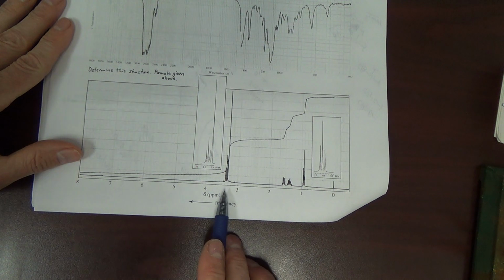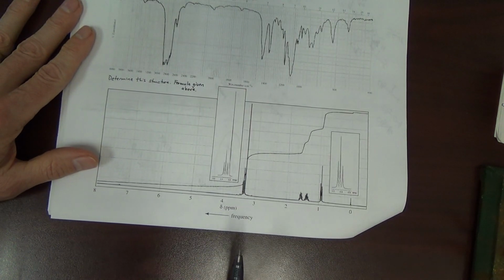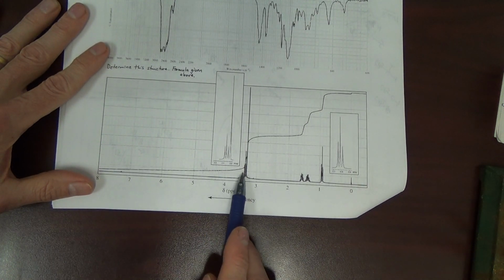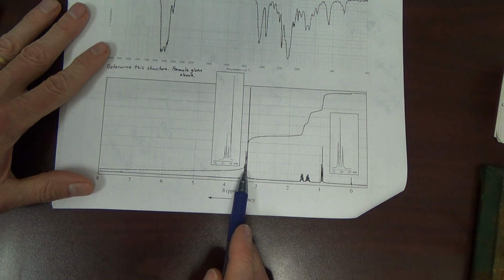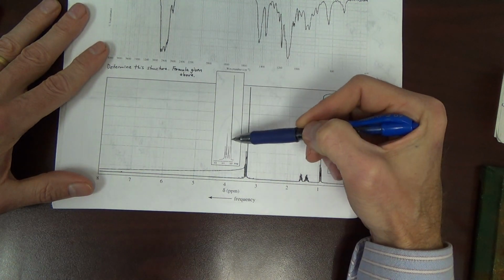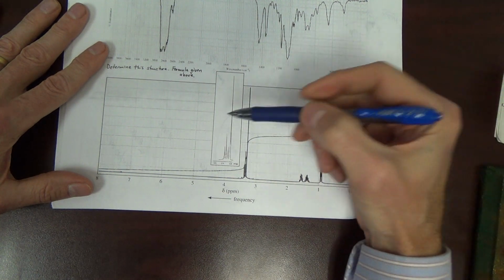We have, okay, TMS. You got to be careful here. This may look like one signal. All right. It's actually 2. Because if it was one signal, why would you have this side sort of short and then tall? I mean, it's 4 lines, but that's certainly not a quartet. Quartet doesn't look like that.